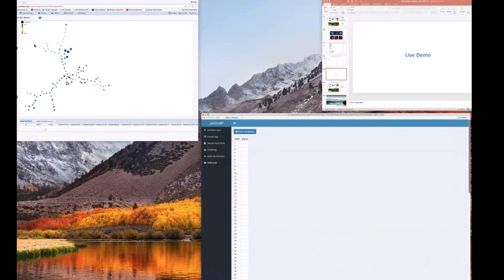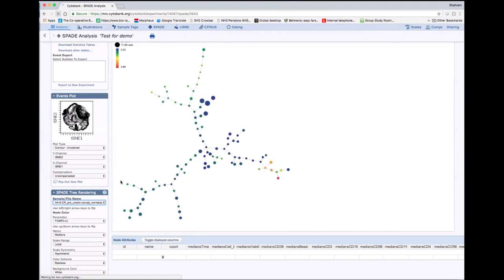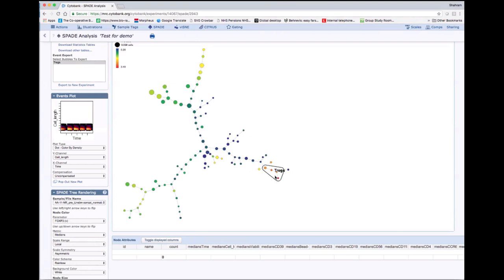Going back to Cytobank and updating our SPADE tree, we can now see that we have defined five nodes as T-regs based on the distribution of the three markers — but not the intermediate ones. The SPADE bubbles are applied to all the groups of the analysis, as expected.